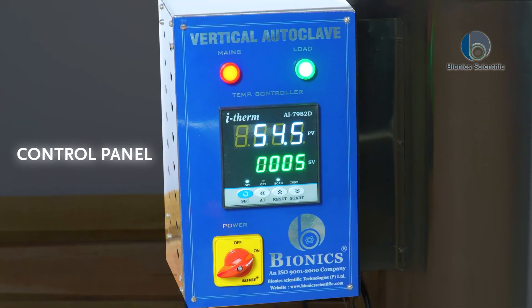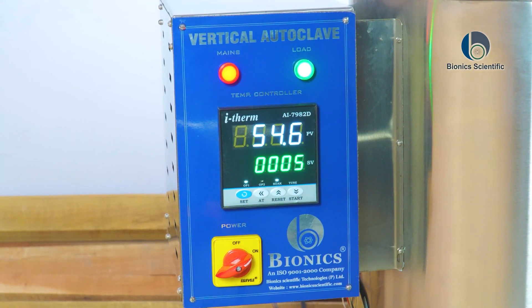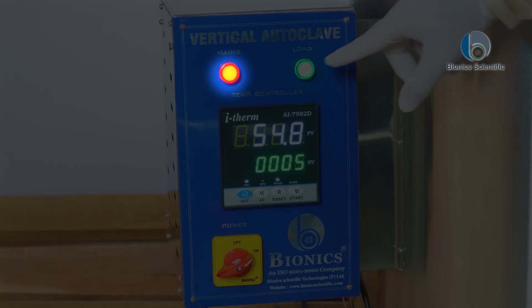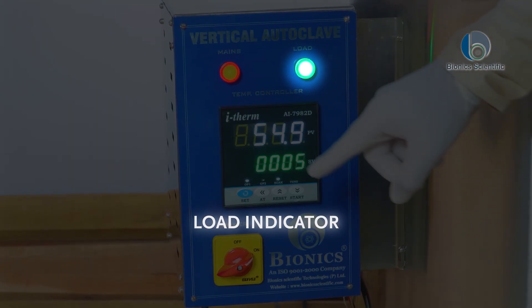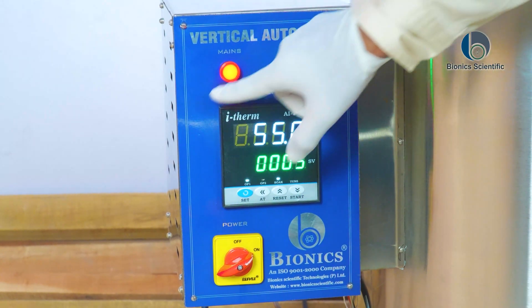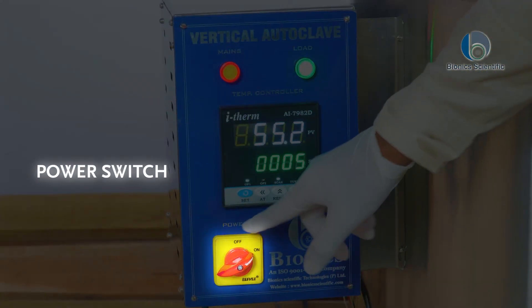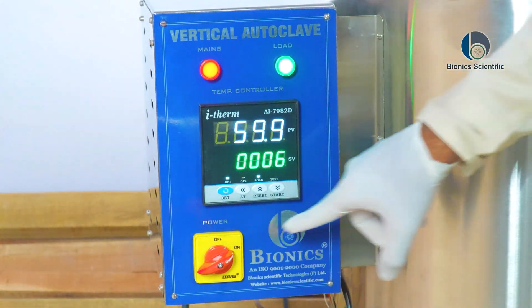On this control panel there are a few things available. First is the main key, second is the load indicator, third is the control panel display, and the last one is the power switch.